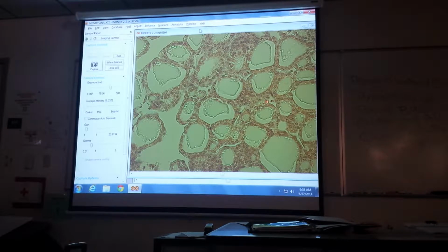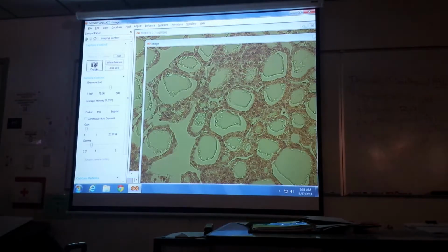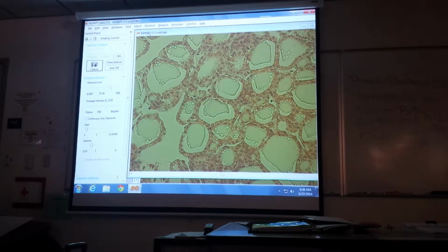Oh, that one's really clear. I don't see any cytoplasm at all. I'll just take a picture of this. It's all looking the same to me on this slide. Good enough. Okay, so I'm going to move on to the next slide. Pituitary. Any questions? Yeah. Can you point it out again?